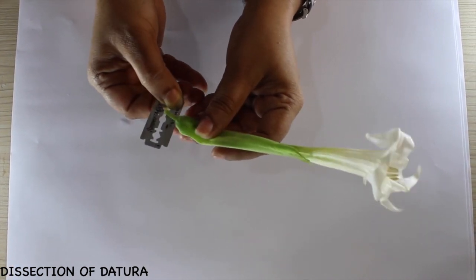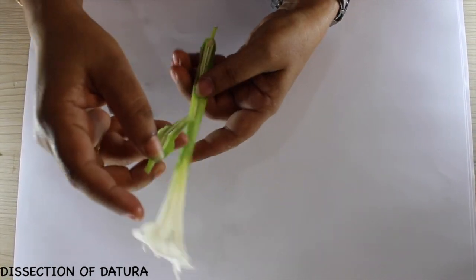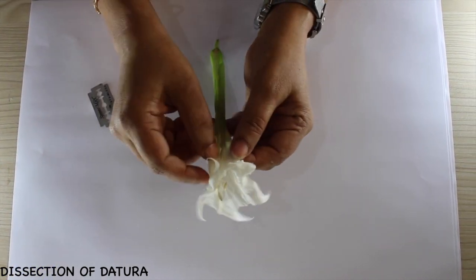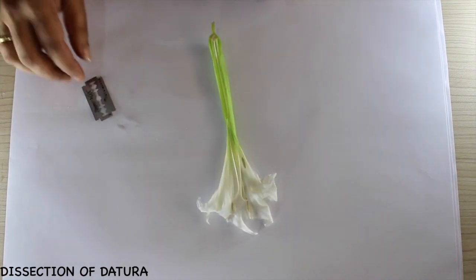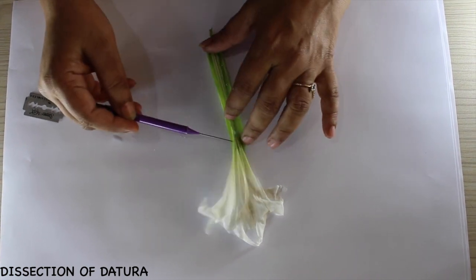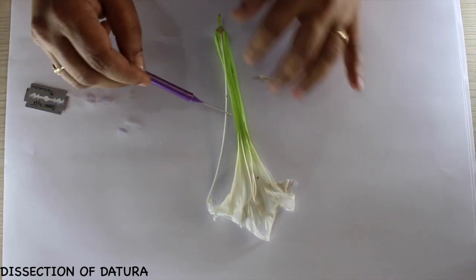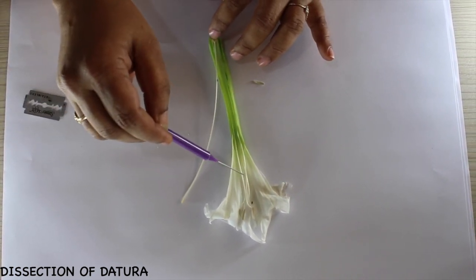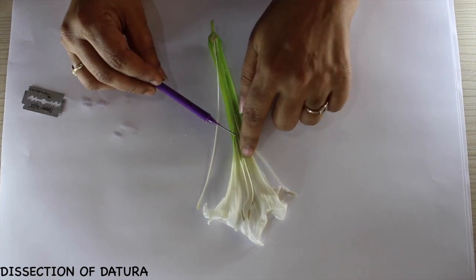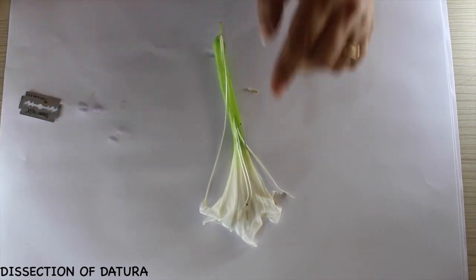Let's now see the dissection of Datura flower. We begin by cutting from the pedicel and pulling out the part of the flower very carefully without damaging or removing the gynoecium. We first have a look at the cut surface and then try to pull out the gynoecium. This is the way it has to be pulled out to one side, and then we pull out one of the stamens on the other side — this is how we pin up the flower to label and show it to the visiting examiner.